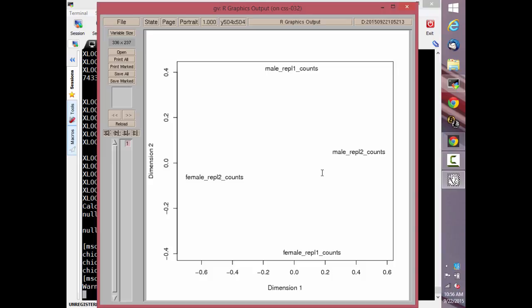The more things you record about a sample before you take it, the better off you are. The likelihood is very high that you will never need to know who actually extracted the sample, or what time of day, or what color the egg was. However, you don't know until you get to this plot, which should be, at best, about a month after you collected the data, because it has to get sequenced. You never know what this plot is going to look like, and if you need to find any factor that might be correlated between all of the samples that group together that shouldn't have, metadata is the only way to find it out.